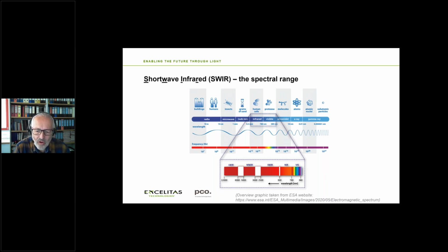There's a short blow-up that shows you the small range from visible, 380 nanometers up to maybe 760 or 780 nanometers. And subsequently, there's the so-called near-infrared range, which has become more popular in the last years because of a deeper penetration of radiation into tissue or cell layers, which is very helpful to get more information out of tissue samples.